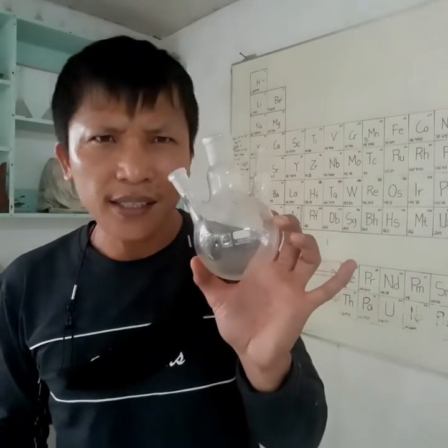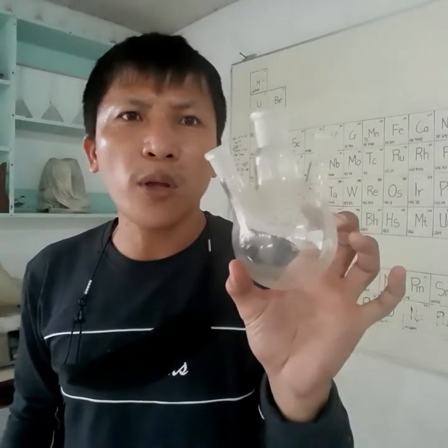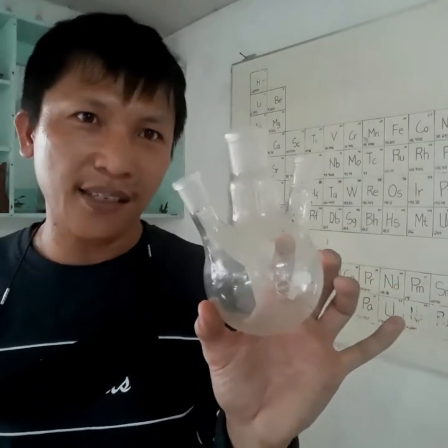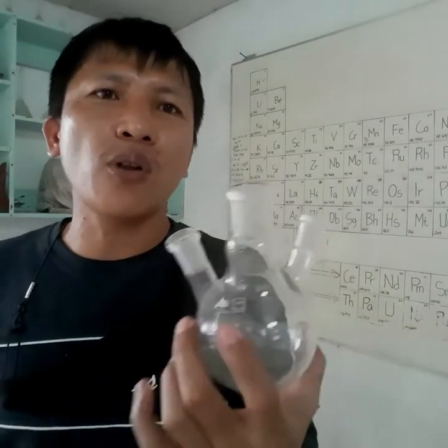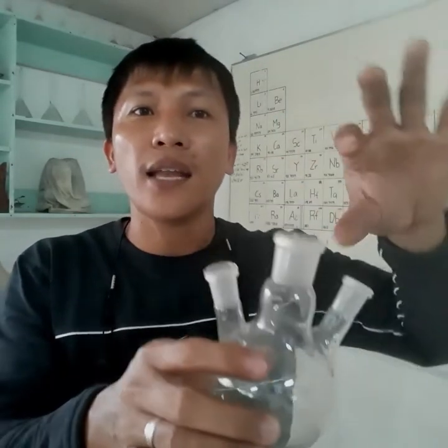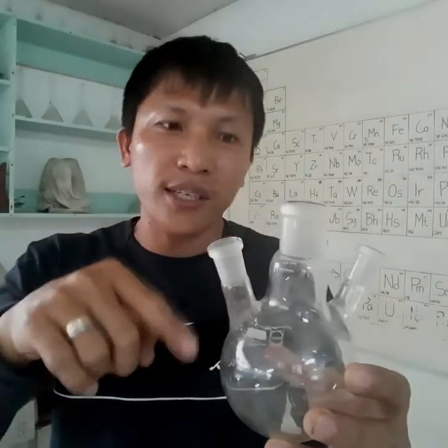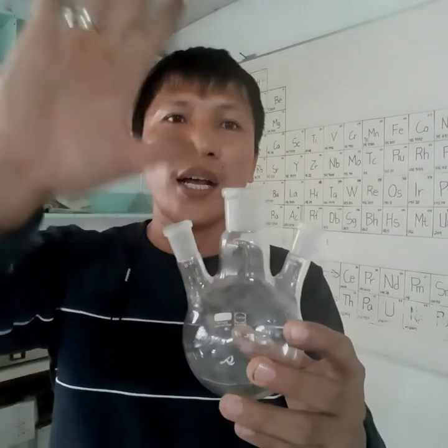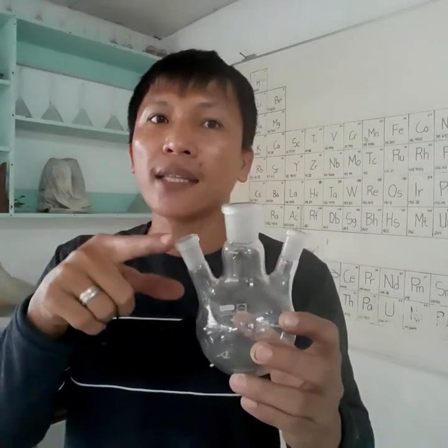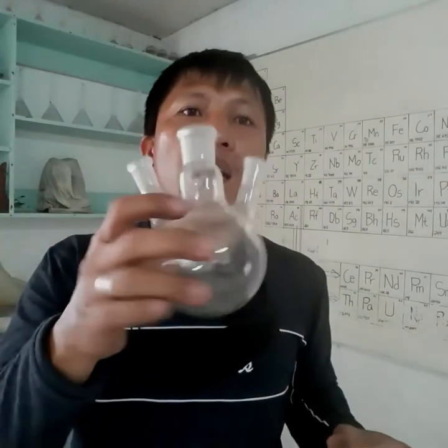Another item here is a different kind of flask — another version of your Florence or boiling flask. We call this a three-arm flask, because it has three arms. For example, you can put a thermometer on one side, have vapor going up to a condenser on another, and then pour another chemical from the third arm as the reaction and evaporation is happening. So we use a three-arm flask when there are lots of things you are monitoring simultaneously — temperature, reacting species, or other substances.